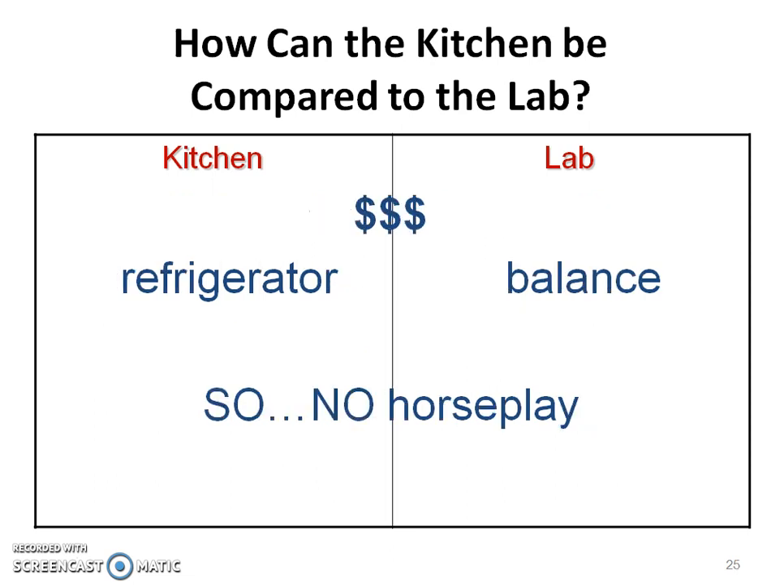Things that are very expensive in your kitchen — there are things that are very expensive in the lab too. There is no horseplay. I want everybody to be safe number one, and everything costs money to replace, so we want to be careful with what we're doing in the lab.